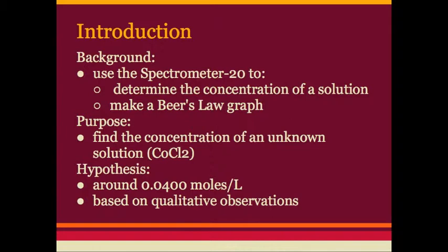When light passes through a solution, ions absorb some of the light, which reduces the amount of light that can pass through a solution. When an electron is struck by a certain frequency of light, it is excited to a higher energy state and releases a photon. This photon moves in a wave-like pattern at a certain frequency, which is visible to us as light. Therefore, a darker solution is more concentrated than a lighter solution, because a more concentrated solution will have more ions, which will release more photons.